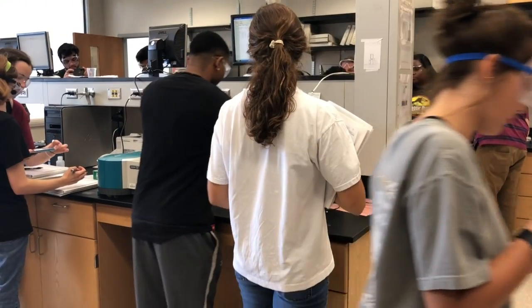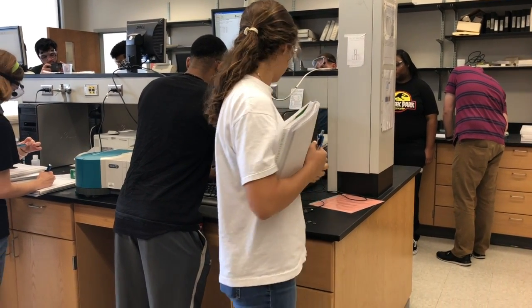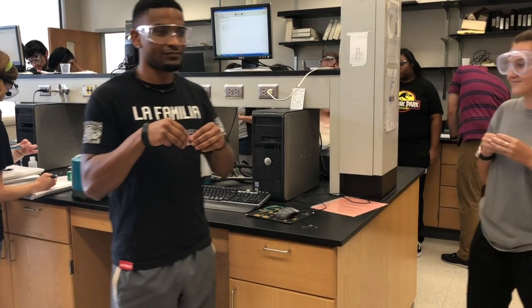After we were done using the spectrophotometer to scan our samples and to record the absorbances, we made sure that our area was clean before we left.